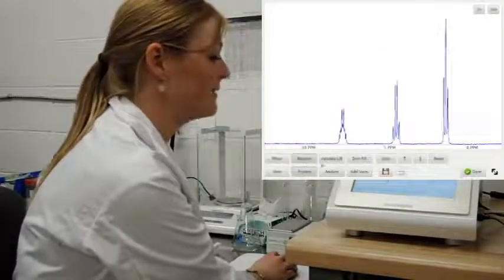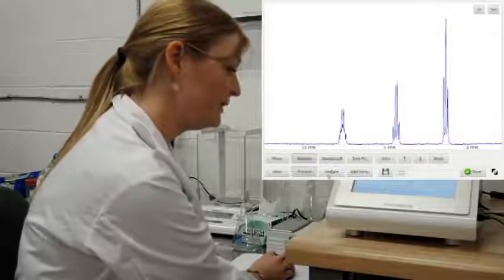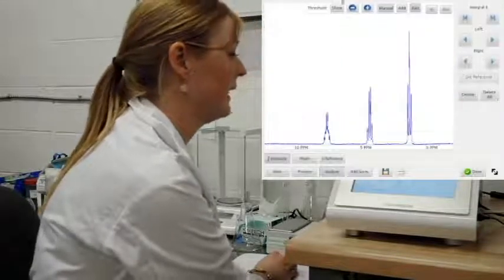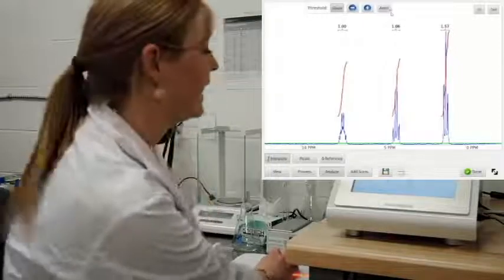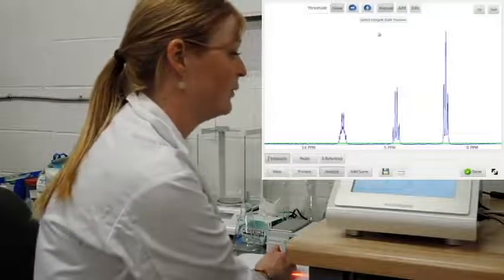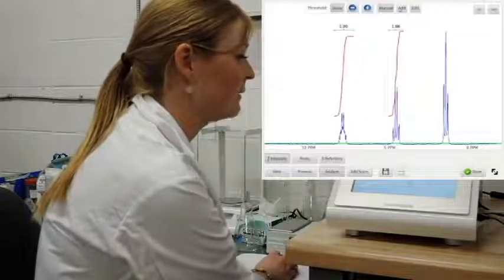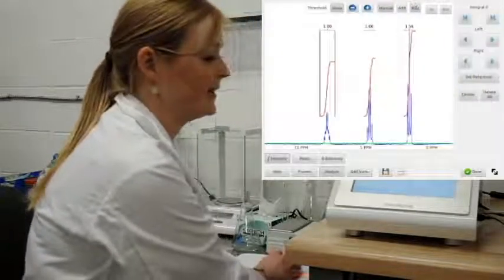When I'm happy with my phase, I'm going to click automatic, do a quick baseline correction, and then move forward to integration. You can use either an automatic threshold, which gives you a very quick integration, or you can set up the regions yourself. So I'm going to click manual add, and I'm just going to select the areas that I'm interested in integrating. This is just a rough start for your integral regions, but they're very easy to edit as well.